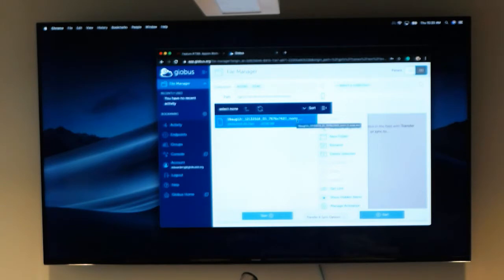If you're collecting data on a Falcon, that folder is empty because it's gain corrected from the camera, from the system. If you're collecting data with one of our K2 systems and then soon to be upgraded K3 systems, you'll see that the gain reference is located here. There are several different gain references.